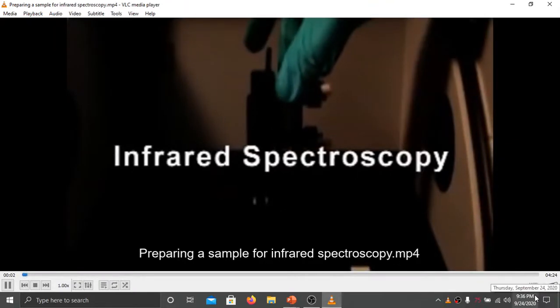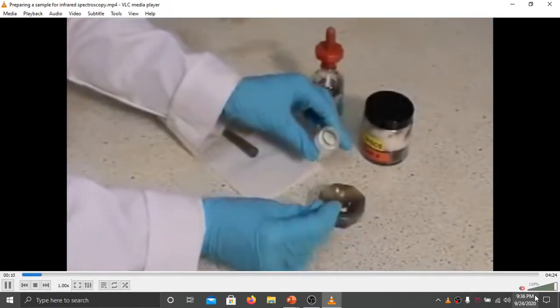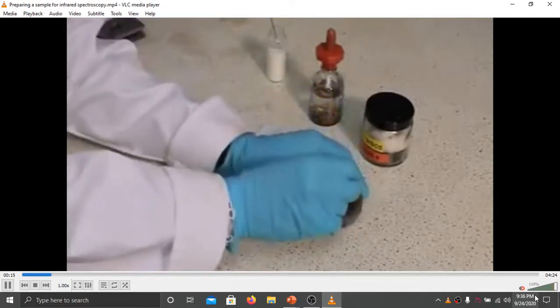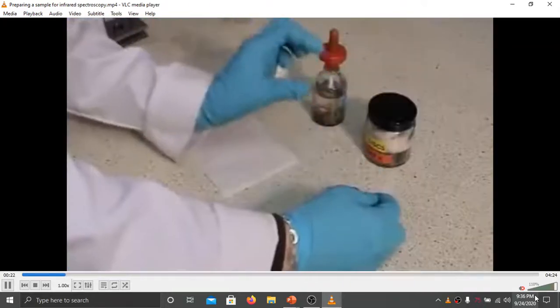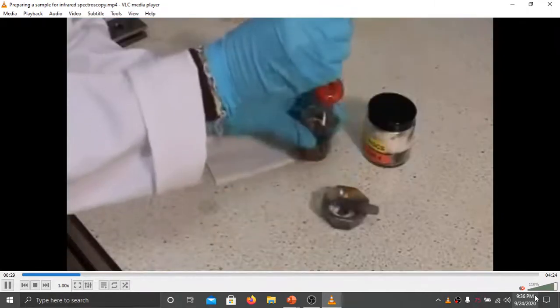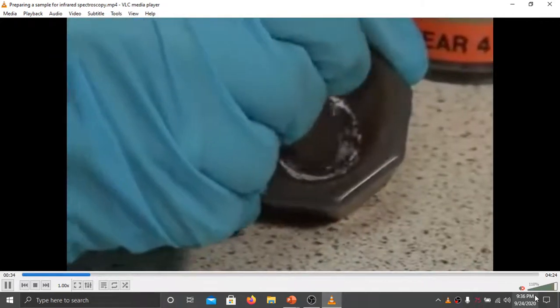In infrared spectroscopy, for preparing the sample, we are thankful to the video makers for allowing us to use it as teaching material. This is the Mull technique I am explaining first. For the Mull technique, the sample is to be triturated thoroughly in a small mortar and pestle. Then Nujol, a mineral oil, is added dropwise. A few drops of this mineral oil are added to the sample, and it is mixed and thoroughly triturated to form a paste of the material.